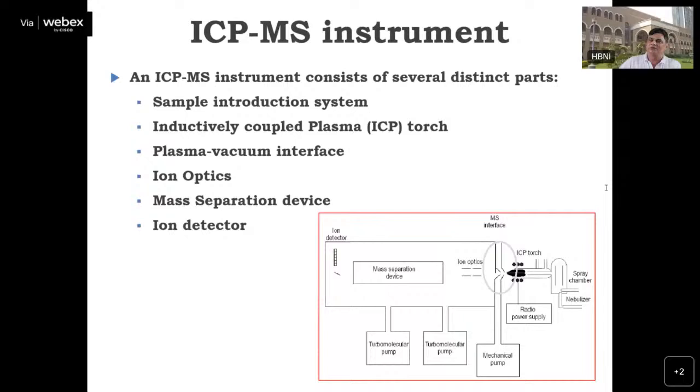But most of the analysis of uranium we do using the ICP-OES. But as I told you, if you have a uranium hollow cathode lamp, one can do it. As such, we are not practicing the analysis of uranium by AAS. Of course, we are doing the determination of uranium on a regular basis using ICP-OES. We use ICP-MS also. We are using laser fluorimeters, as well as voltammetry also.